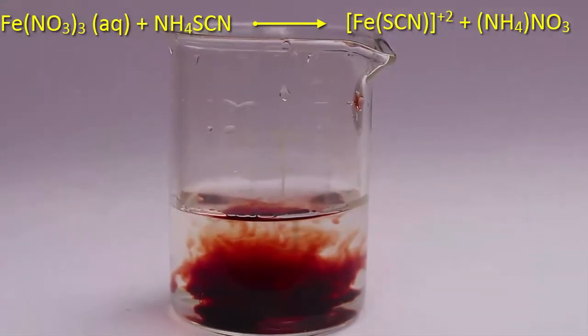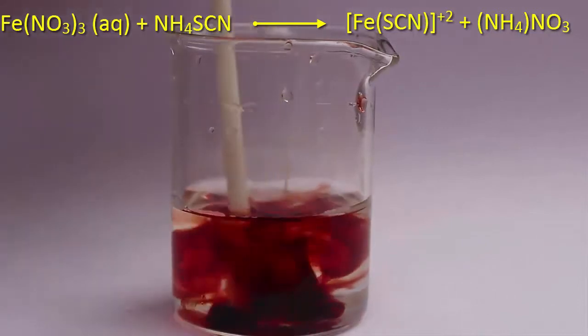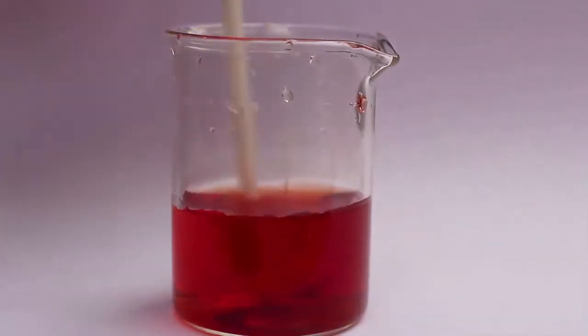What we essentially make is a complex of iron. Isn't this a very interesting experiment?